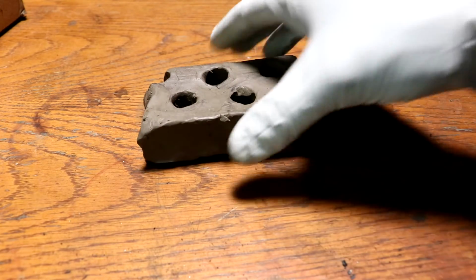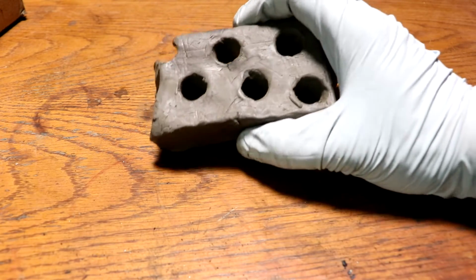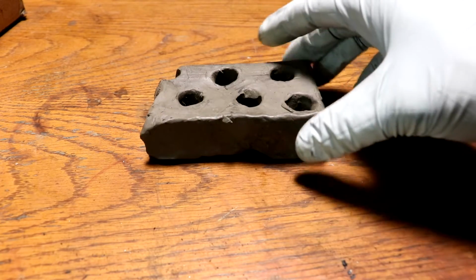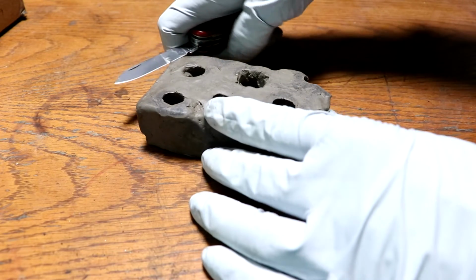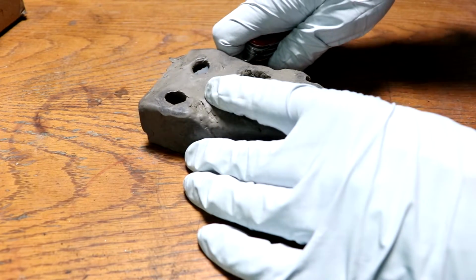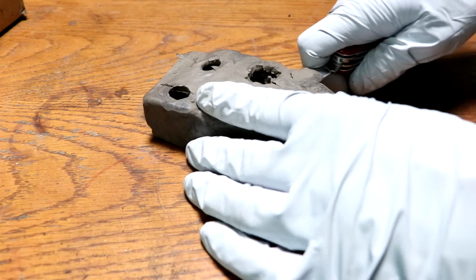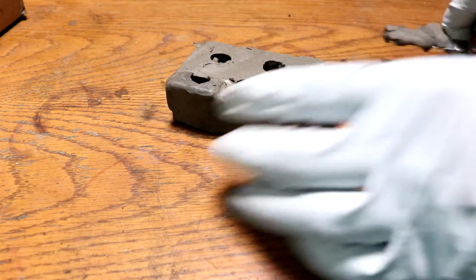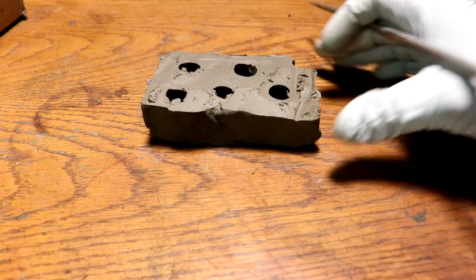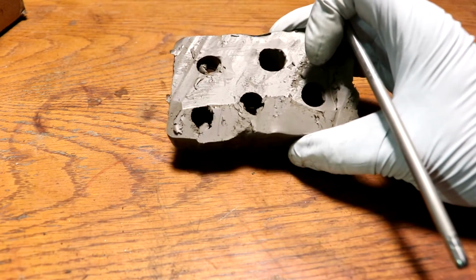Now if we react this with oxygen at high temperatures, you'll burn the charcoal. Oxygen is kind of like a knife. It burns away the carbon pretty indiscriminately. Whatever it touches, it burns off and removes, making the piece of carbon smaller. So what I'm going to do is react the carbon with water instead of air.